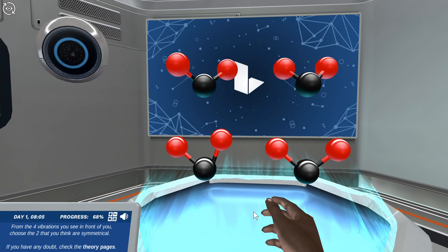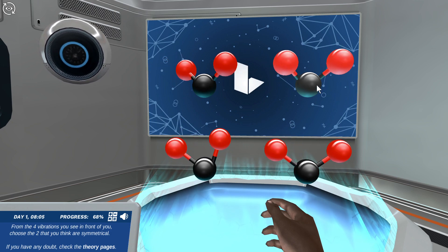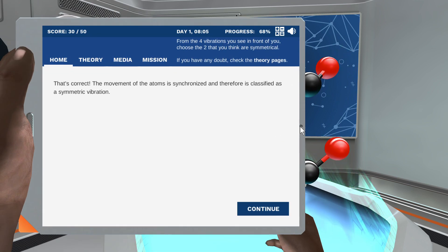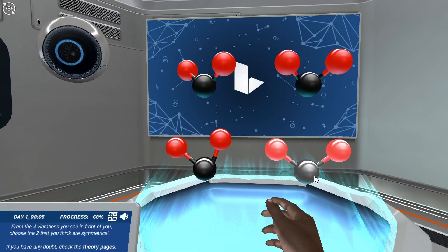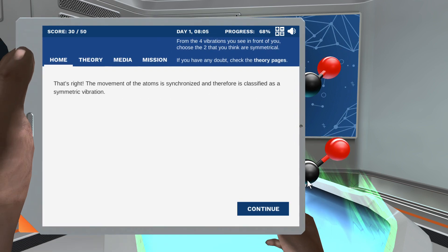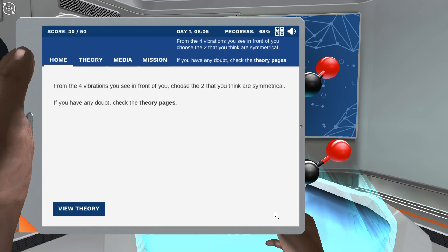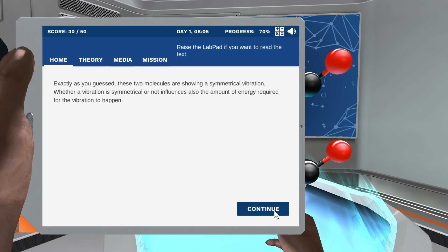Choose the two vibrations that you think are symmetric. That's correct — the movement of the atoms. Exactly as you guessed, these two molecules show symmetric vibration.